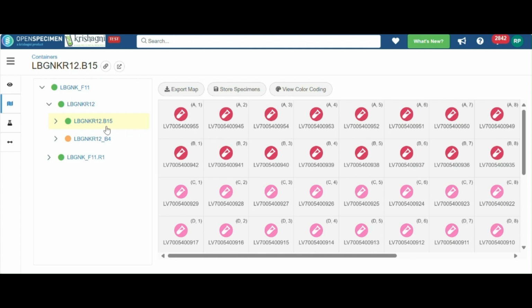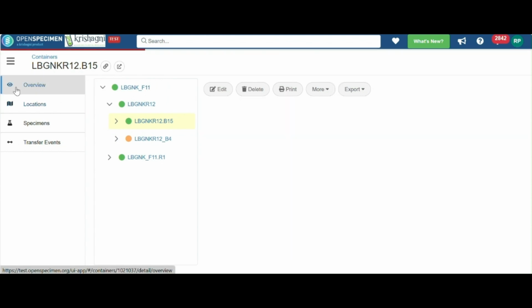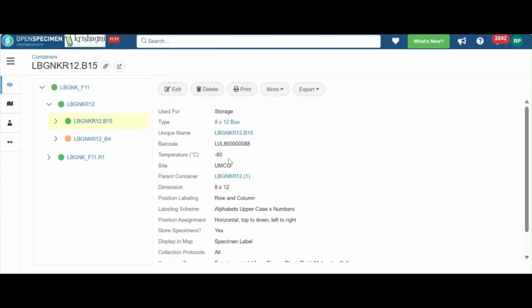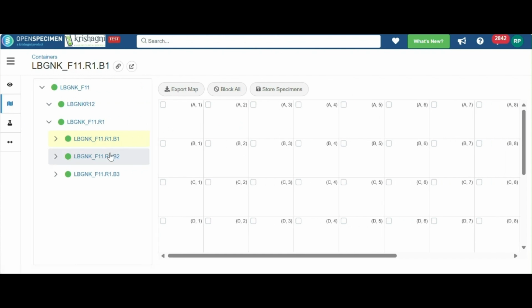This is a new container which is created using open specimen name formats which are defined in the container type, and the box barcode that was scanned in the box scanner is attached in the barcode field. Now if you see the older boxes, all the specimens present within these boxes are now moved to the newly created box.